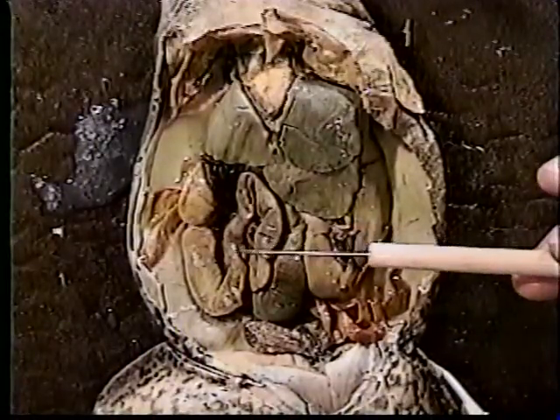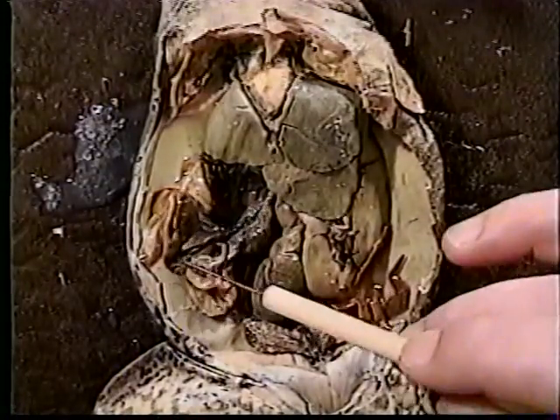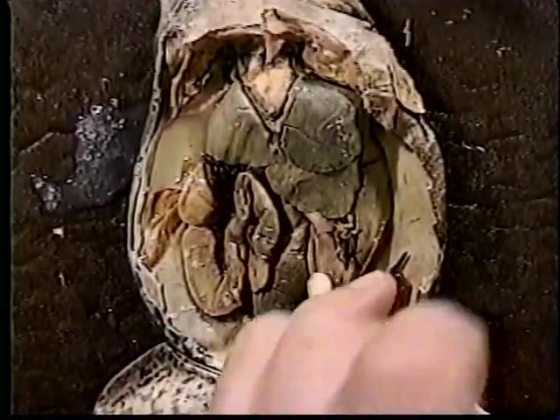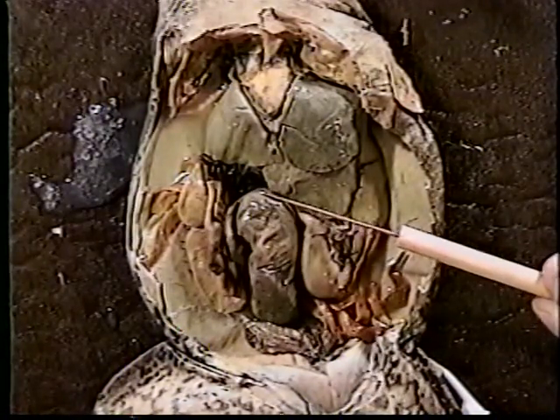From the small intestine, food that is being digested goes to the large intestine. The diameter and the width of this tube fatten as we move towards the anus. Often when we open up this particular organ, we find digested wastes ready to leave the frog's body. From here, we travel downward towards the anus where digestive foods leave.